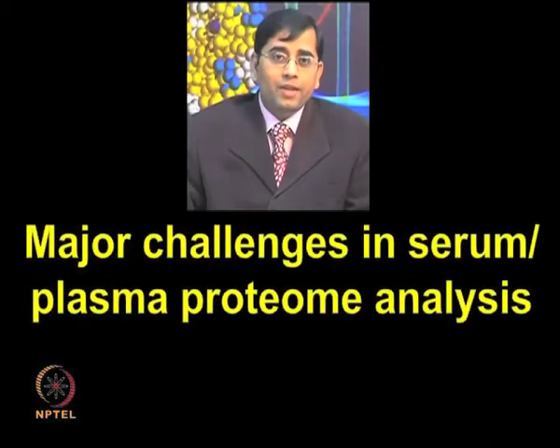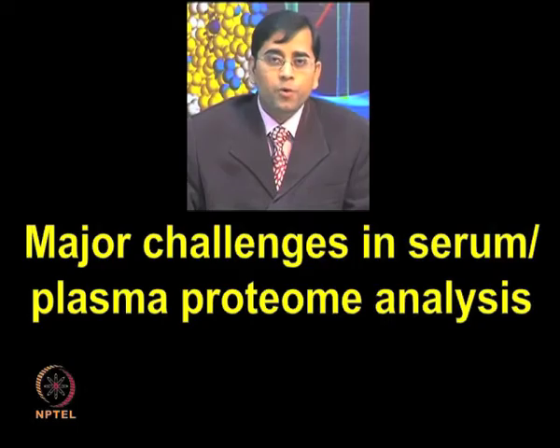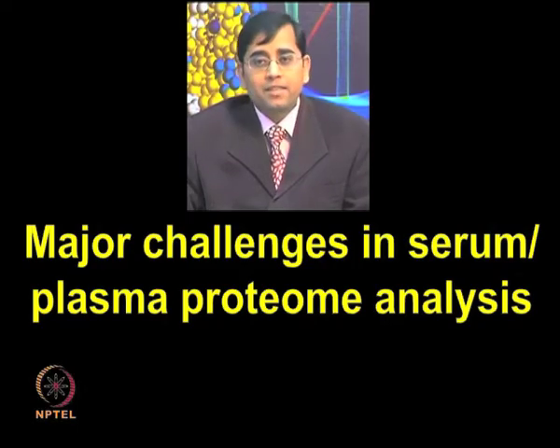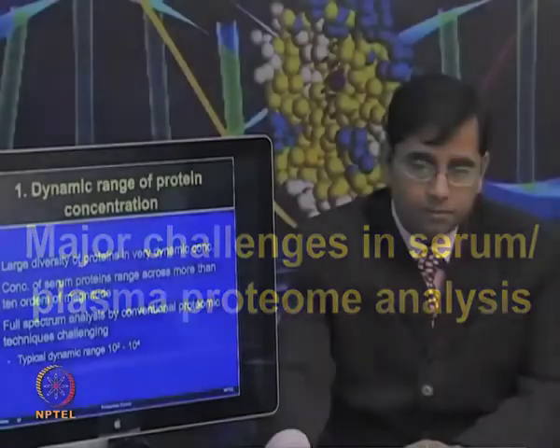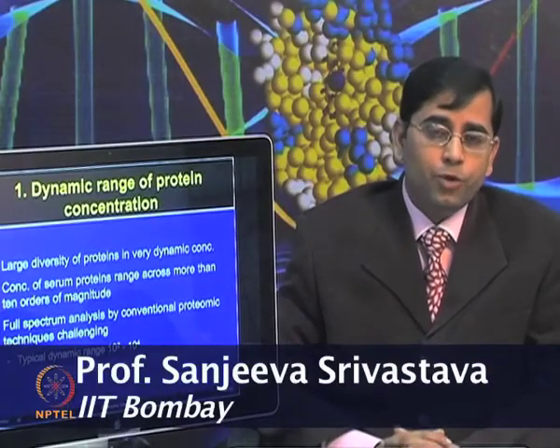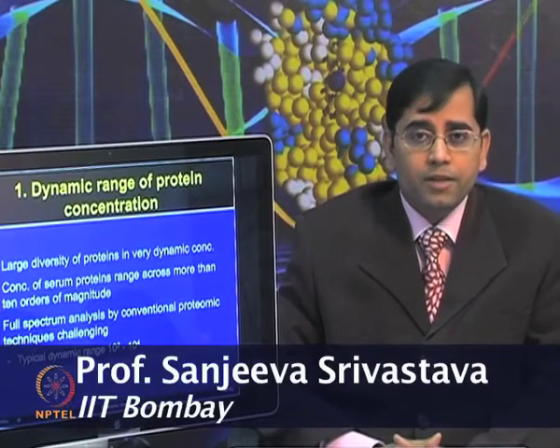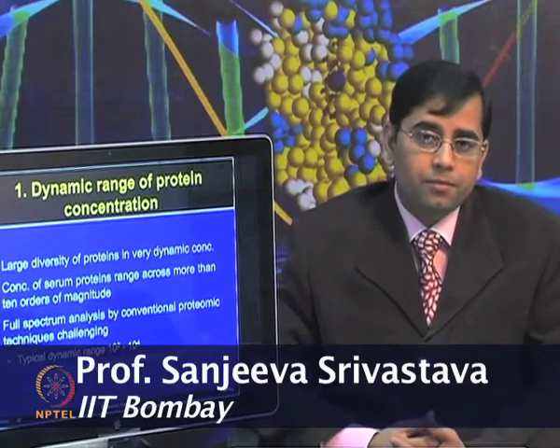Although sample removal is easy, sample analysis, the serum or plasma proteome analysis, is not so easy. There are major challenges in serum or plasma proteome analysis. Let us talk about some of these challenges point-wise. The first point is the dynamic range of the protein concentration.